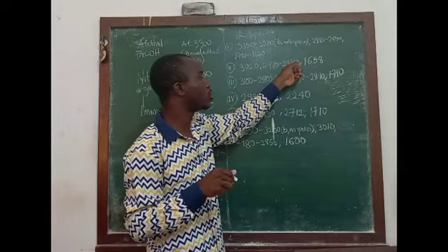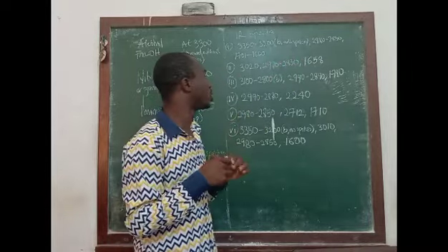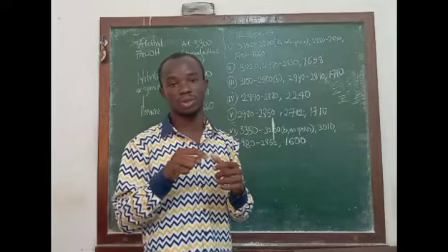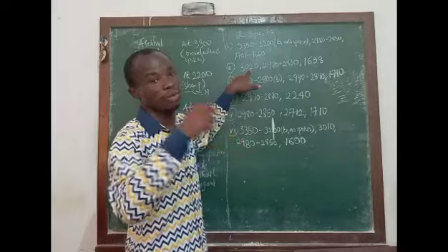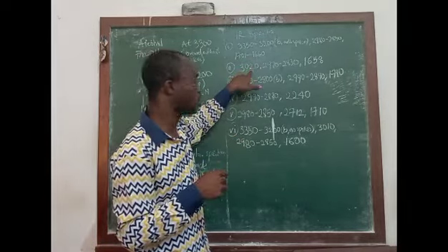In the second spectrum now, we also have a signal just below 3,000, which is between 2,970 and 2,830. So this is a signal just below 3000, which also implies we are having a saturated carbon within that compound. We also have a signal a bit above 3000, which is 3020.